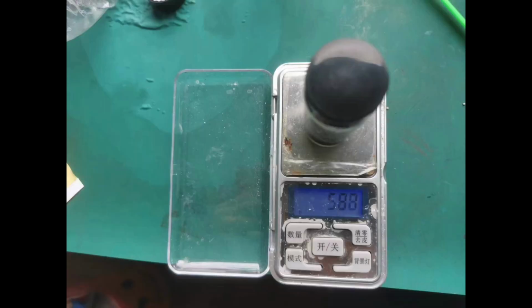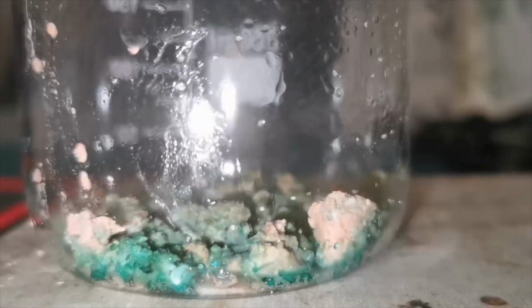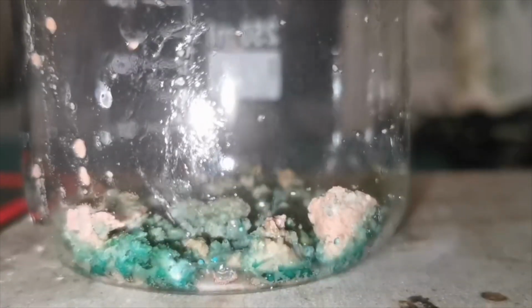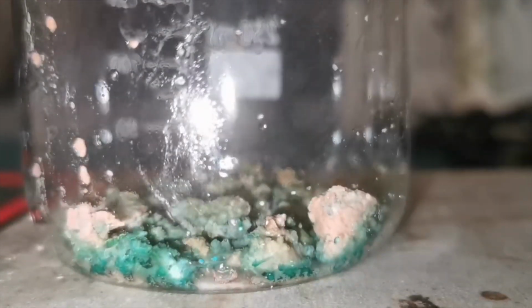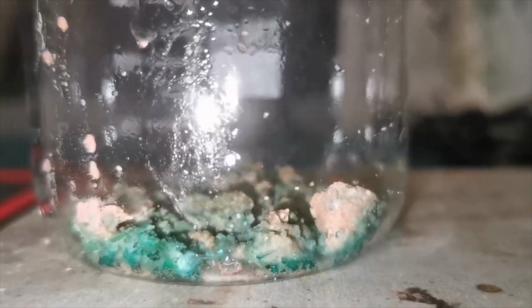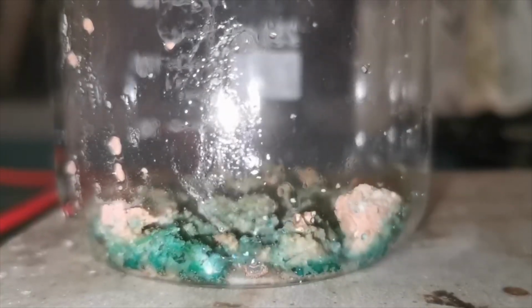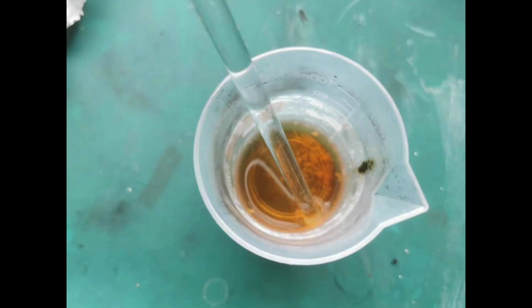The fully dehydrated product weighs 5.88 grams, which means that we've lost about 1 gram of water. This is around 14.5% of the sample's original weight, and if we substitute the formula of cobalt chloride monohydrate in the equation, it fits quite well. Just to really make sure this black powder is actually cobalt chloride, I dissolved a pinch of it in water and immediately gave the vibrant red-orange color of cobalt ions.